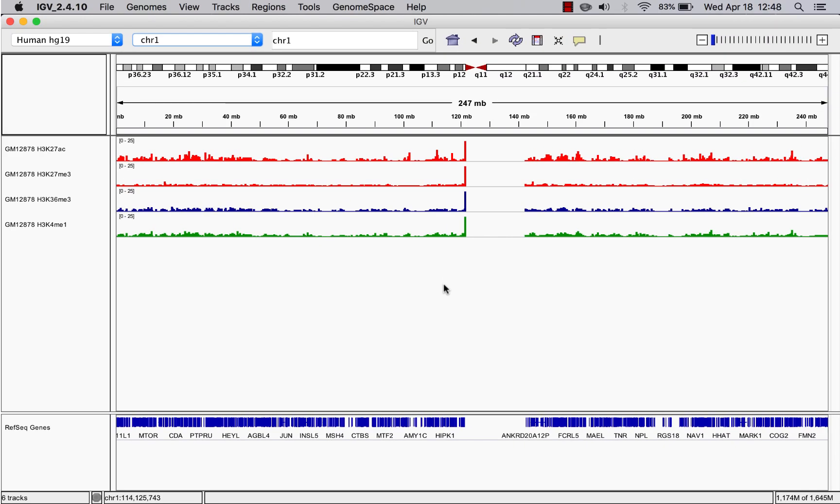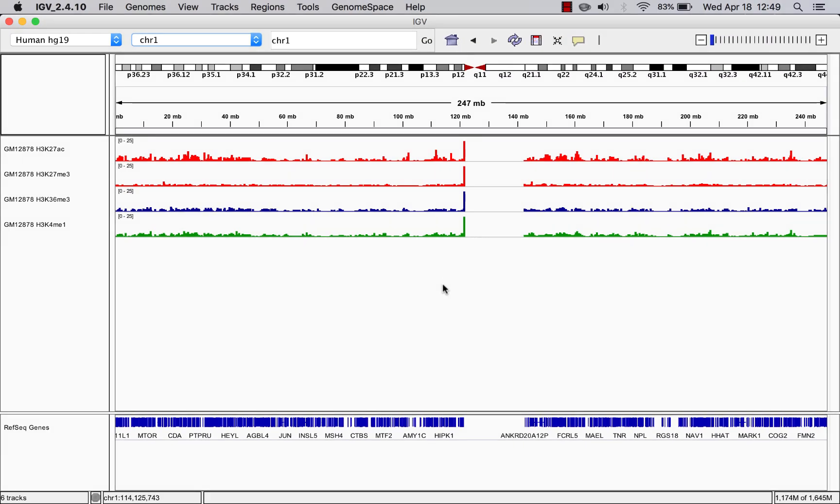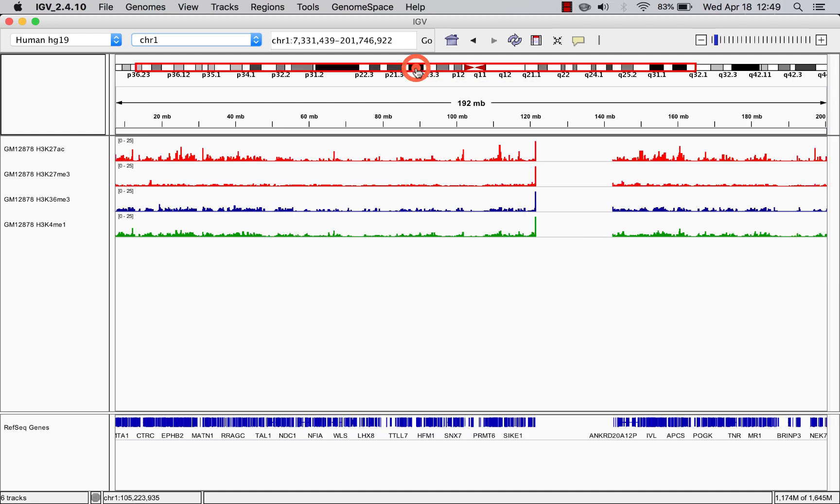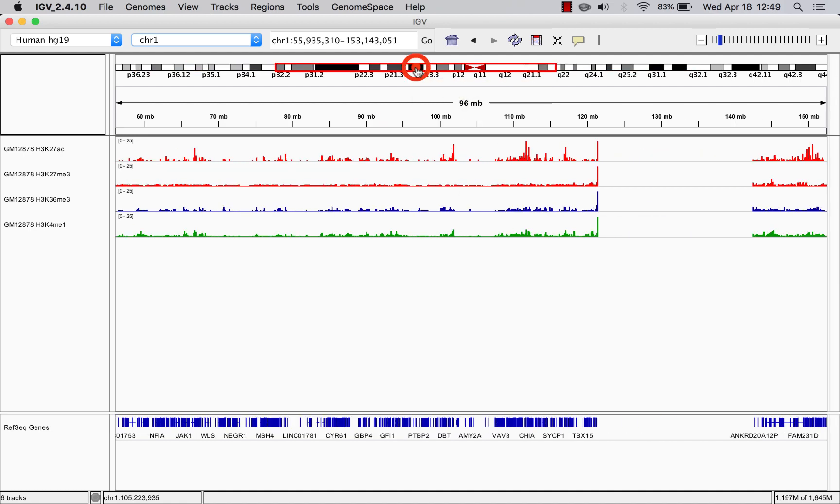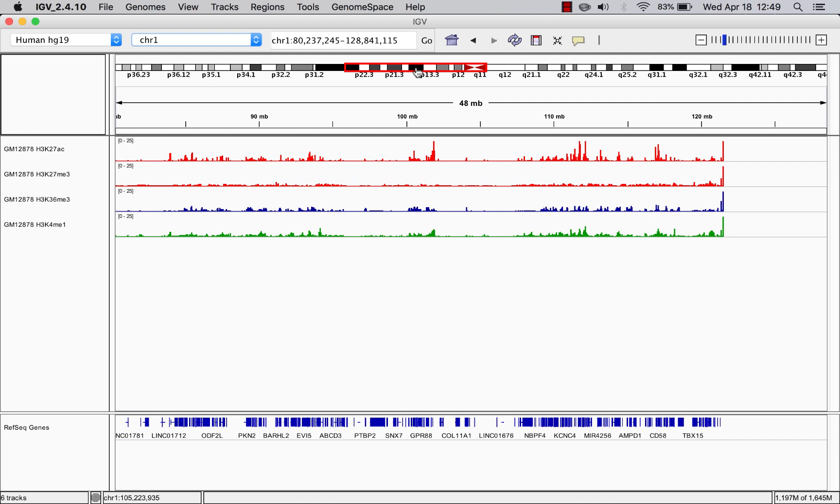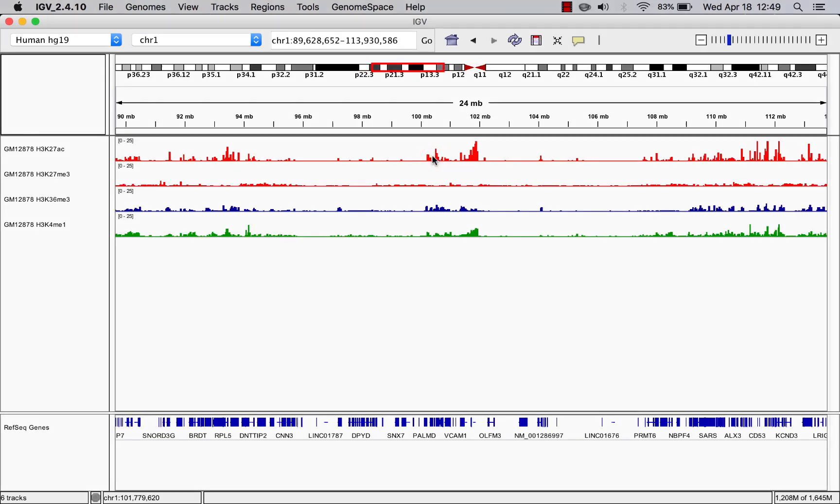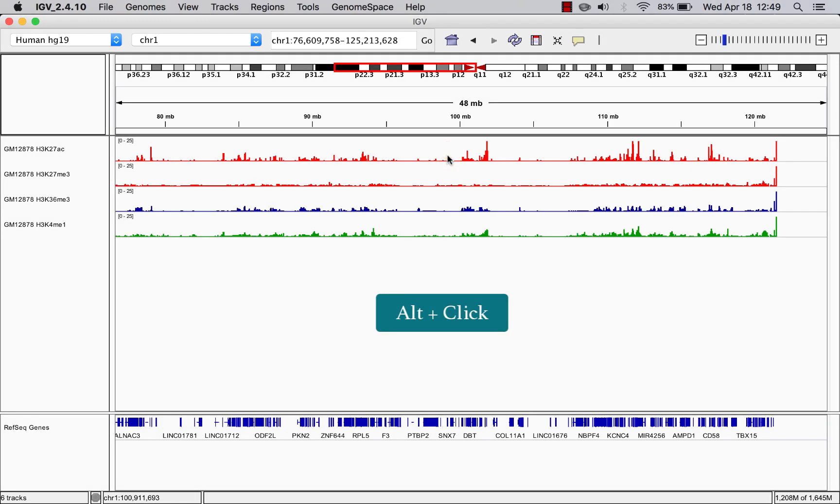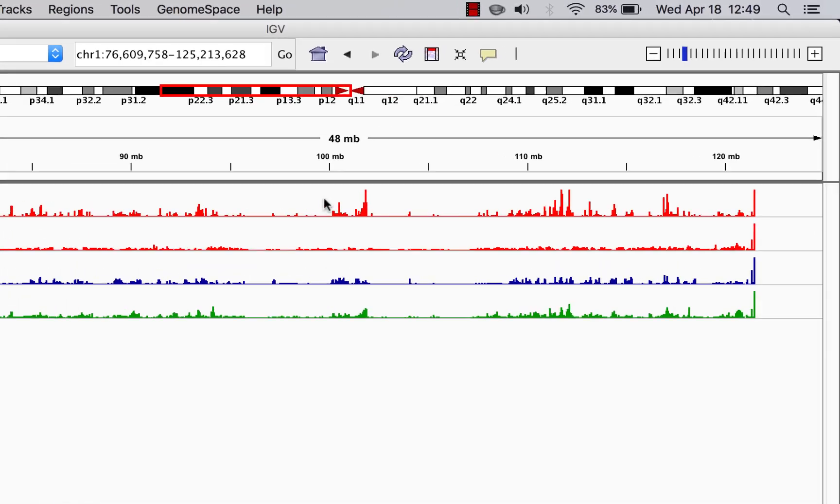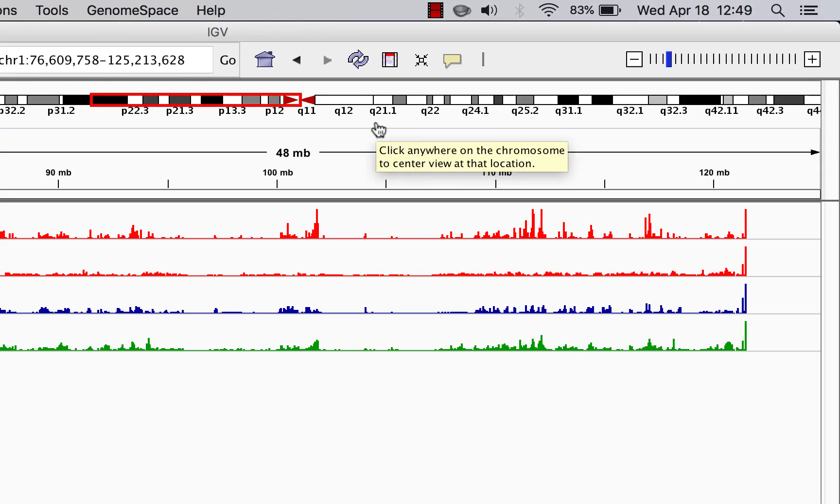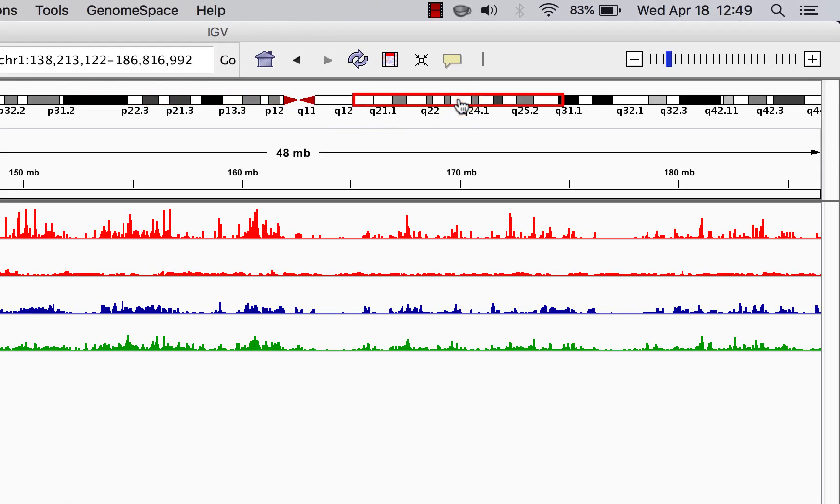Now let's say you want to zoom into a particular region. You can either double-click the cytoband or you can double-click the data tracks. To zoom out again, you can press Alt-click. As you move through the chromosome, a red box on the cytoband will show what region you're looking at.